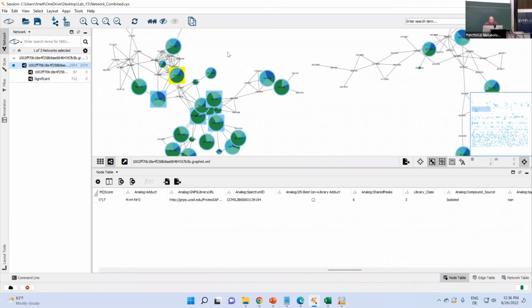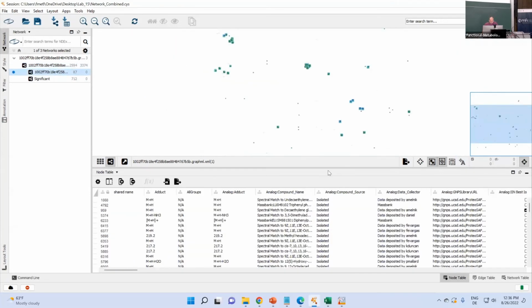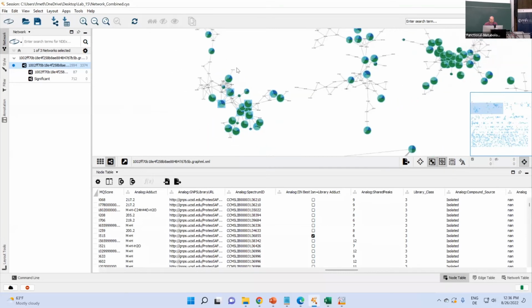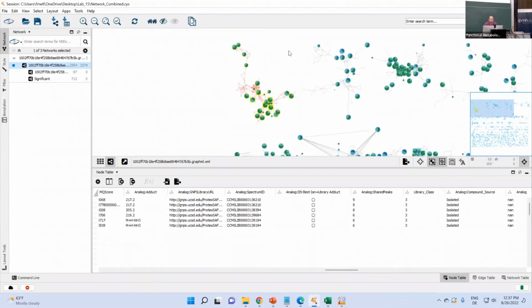Okay. I think before we move to the lunch break, I just want to show you now what I do if I found something that I thought was interesting, right? So I created a subset already, but let's assume you're still navigating in your main network, and you now found here this network that has a lot of features that were significant and may also have some interesting IDs. So what I would do is I would mark the full thing by holding Control and then making this box with the mouse around it.